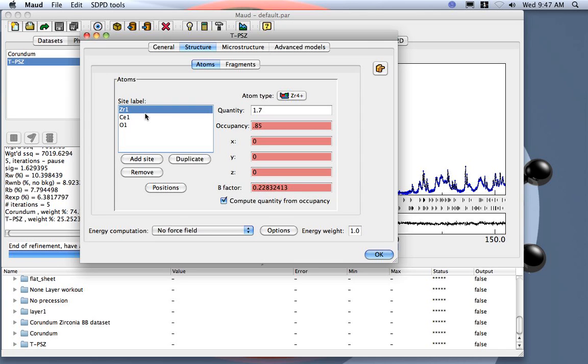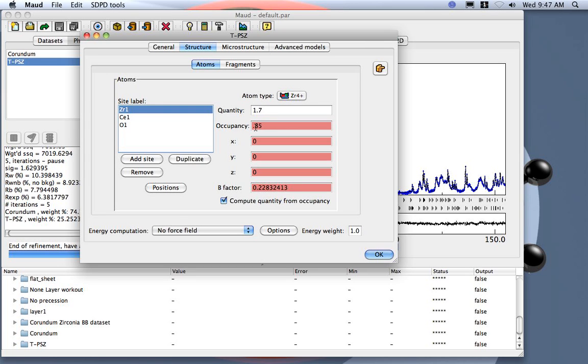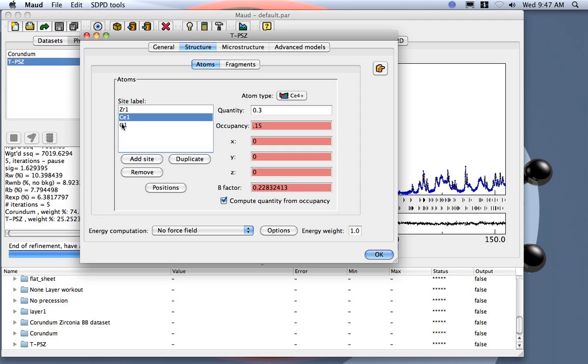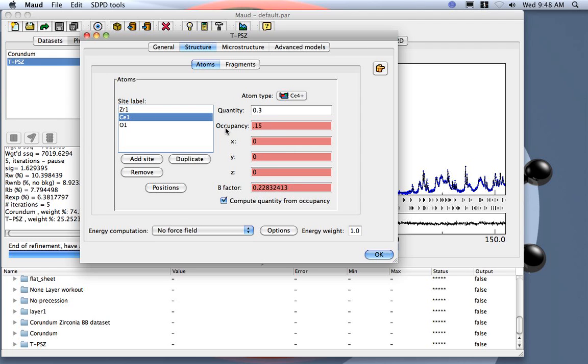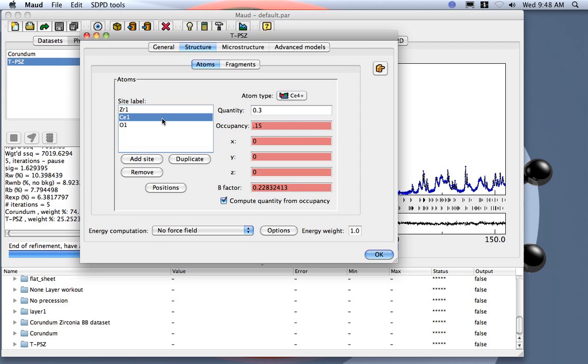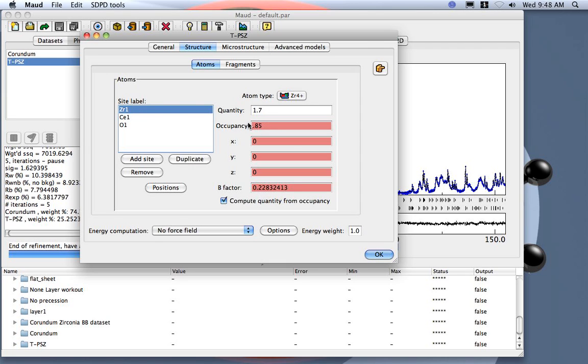The cerium and zirconium occupy the same site, but the occupancy is 85% for the zirconium and the rest is cerium oxide. The oxygen is in another position. Normally when you deal with something like this, what you want is that the cerium occupies what remains left from the zirconium. In Maud, we can do the following: we can set the occupancy of the cerium atom.